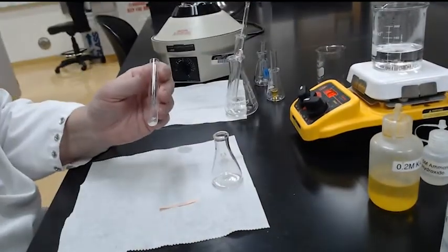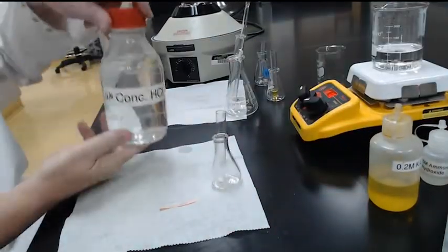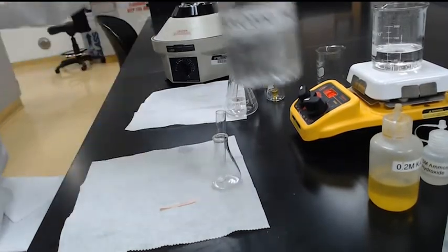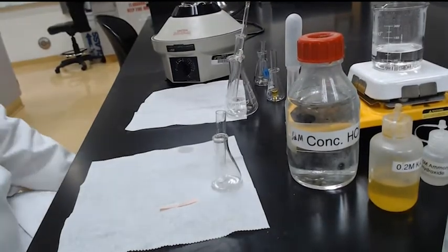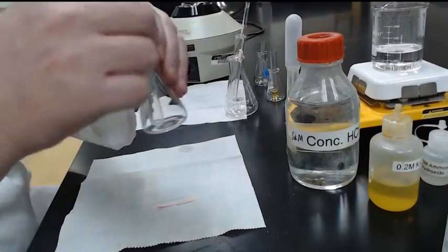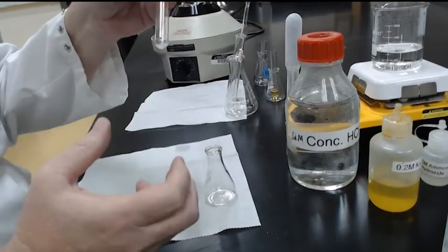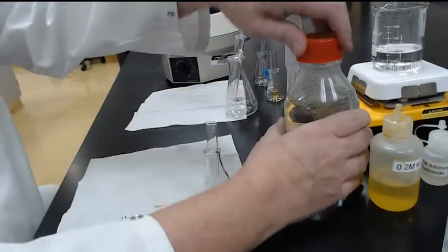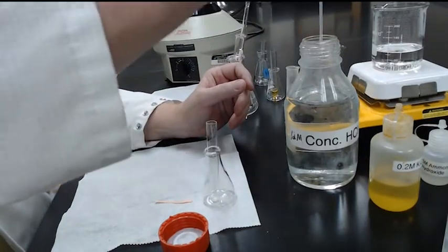Okay, so it is time for concentrated hydrochloric acid. Usually you do this under the hood because this gives off vapors. I'm going to hold my breath. And hopefully what we're going to do is add 1 to 3 drops so that this solid just barely dissolves, and we'll have a nice concentration to go test for a flame test for the barium ion. And so we will pause as soon as I dissolve this.